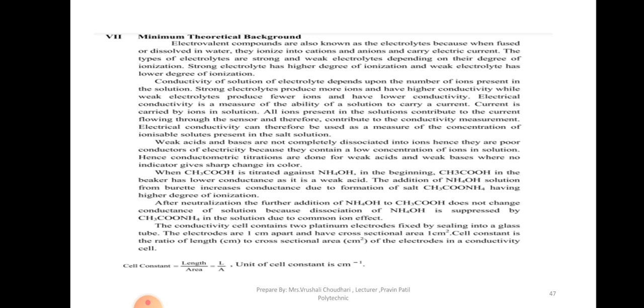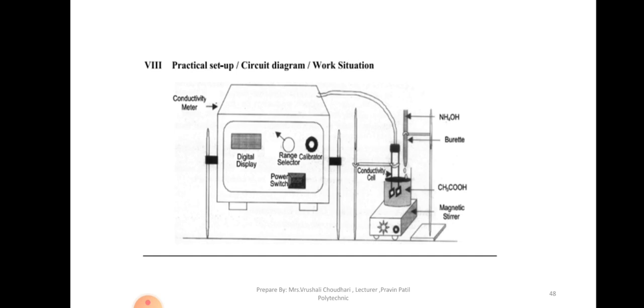Here we are going to perform titration of acetic acid with NH4OH. Both are weak electrolytes. So we are going to determine the conductivity and the equivalence point of the titration.